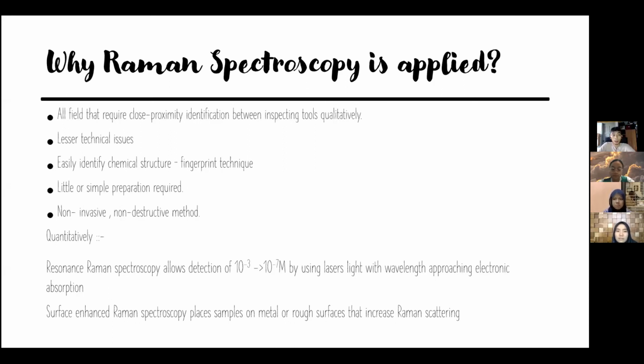First, because all fields require close proximity identification between inspecting tools qualitatively, then lesser technical issues, then it easily identifies chemical structure, used as a fingerprint technique, then little or simple preparation required. Next, it is a non-invasive and non-destructive method, so it can be used many times.